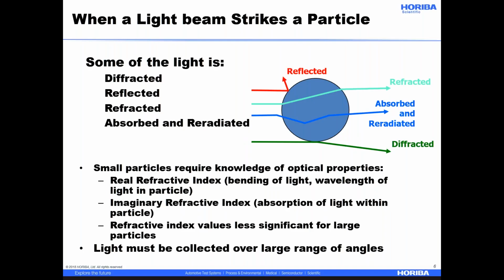For small particles, you will want to know what's happening to light inside the particle. And then there's a simplification I'll mention later. If the particle is large enough, you can pretend it's opaque and just absorption happens.